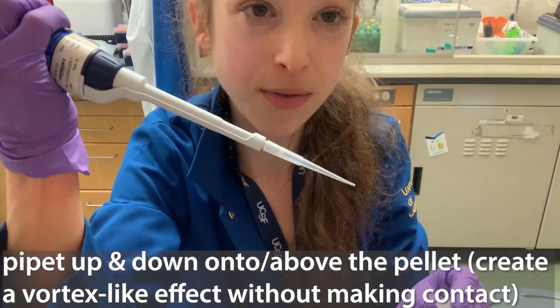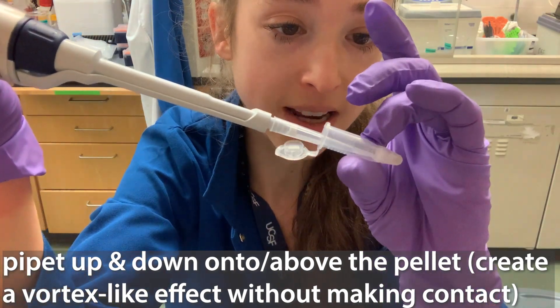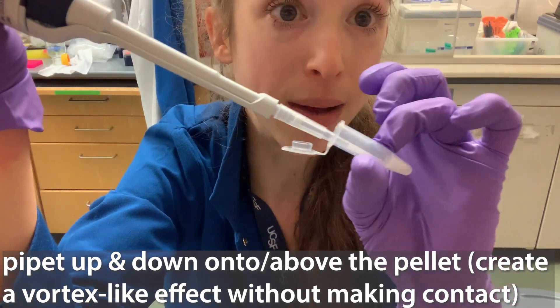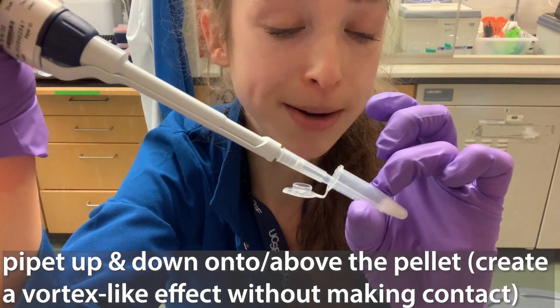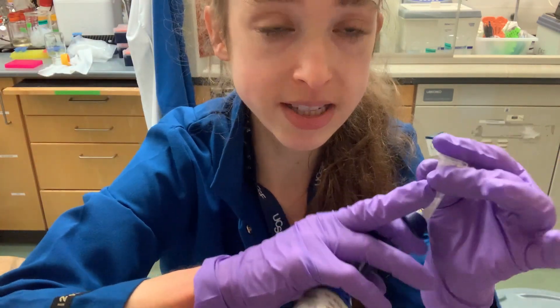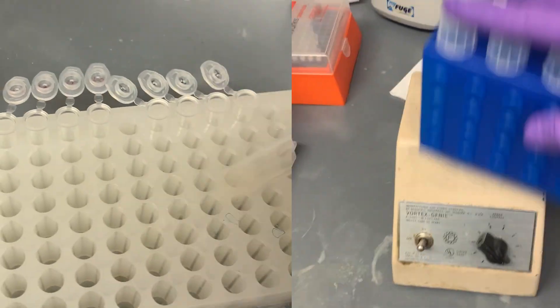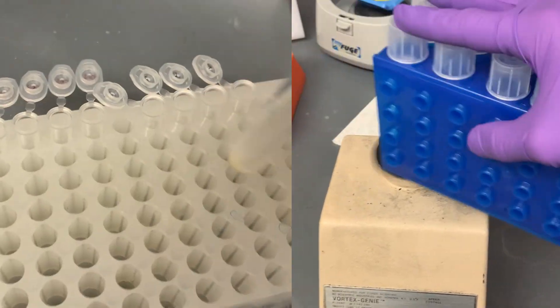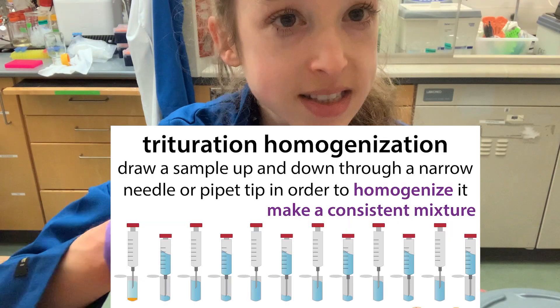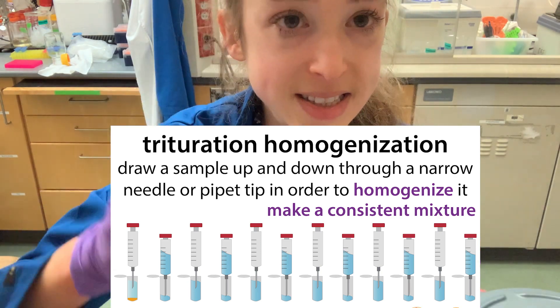So you want to have a vortexing effect where you're basically just mixing right above the pellet, making the liquid give it a really fast jet stream effect. This is going to help you resuspend that pellet. It's going to be a lot easier to fully resuspend and homogenize it, make it all consistent, if you've started by doing something like the scraping or the vortexing. But then you still, with all of those techniques, want to go and make sure that everything is evenly distributed and homogenous throughout.